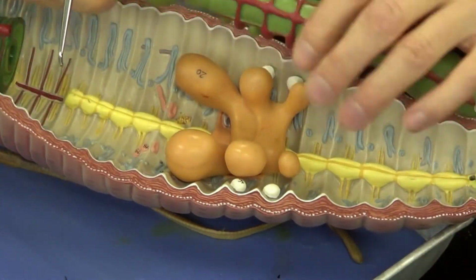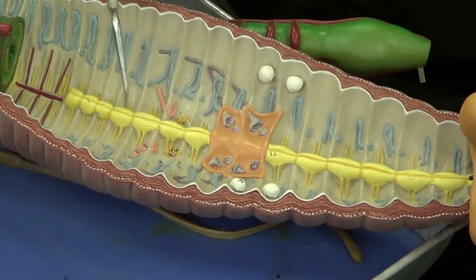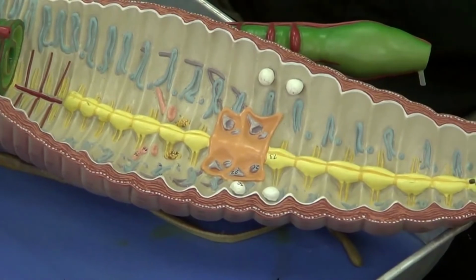Along with that blood vessel runs a nerve. And you can see that nerve right here. It's a very large nerve, and we're going to call it the nerve cord. It's sort of analogous to your spinal cord. And that nerve cord is going to run the length of the earthworm.